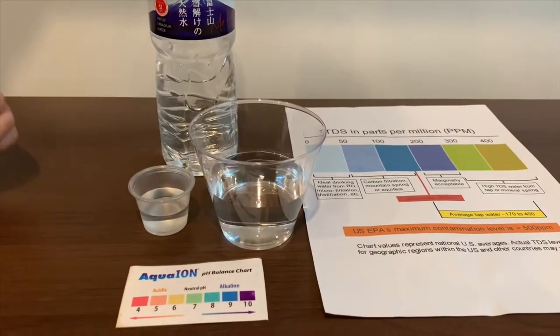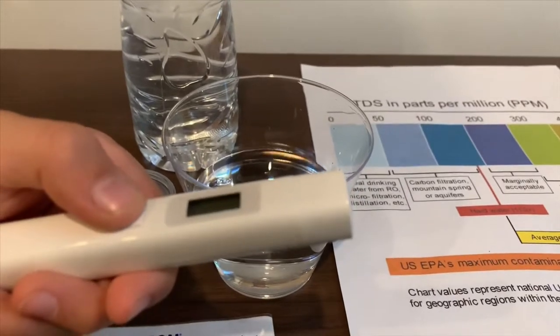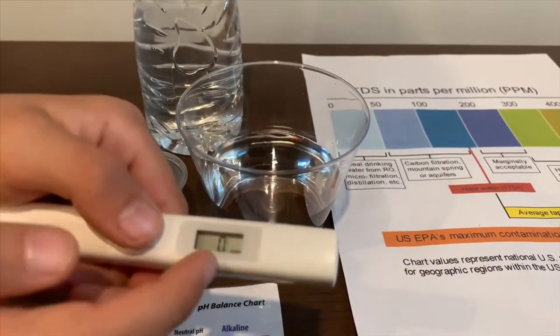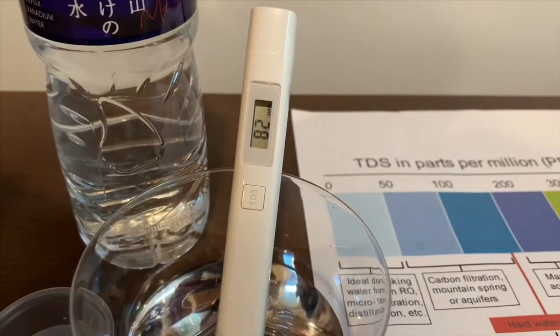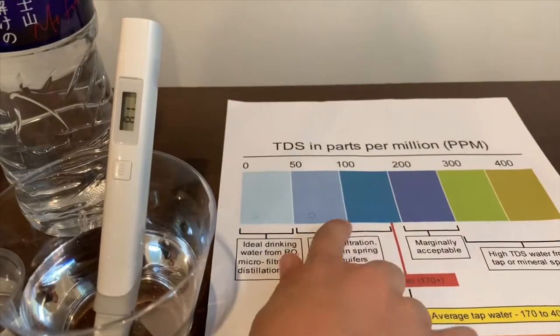First, we're going to test the TDS level. If you want to buy this TDS tester, check the link down below. Turn on the TDS tester, make sure it says 0 and put it in. 82. That is okay to drink.